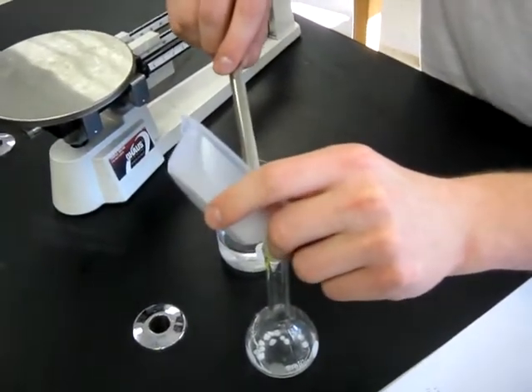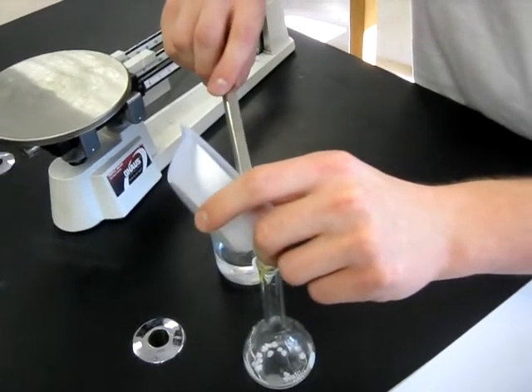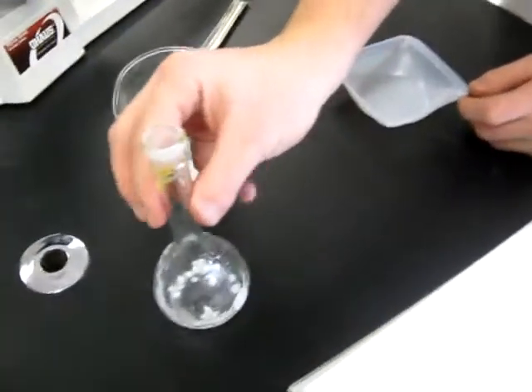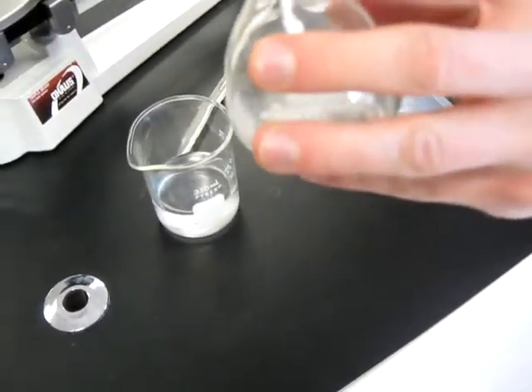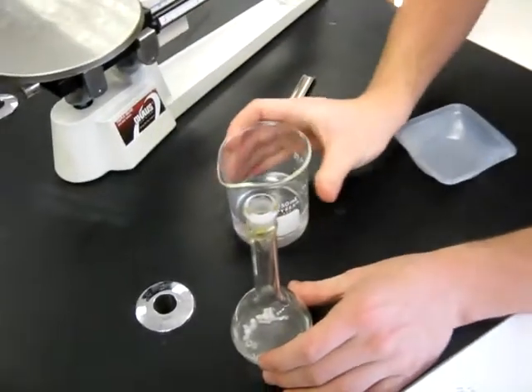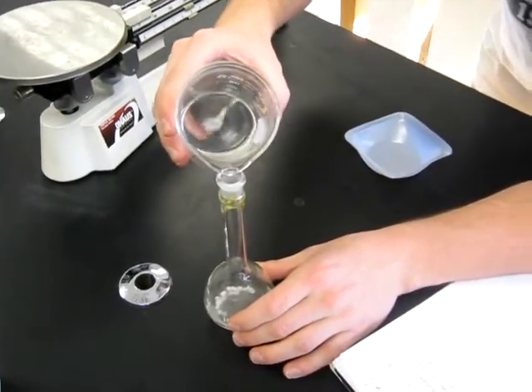So we're just about there. Okay, so now that we have those in there, I'm going to go ahead and add more water until it reaches the 100 milliliter mark on the flask. We get 100 milliliters of our base for the titration.